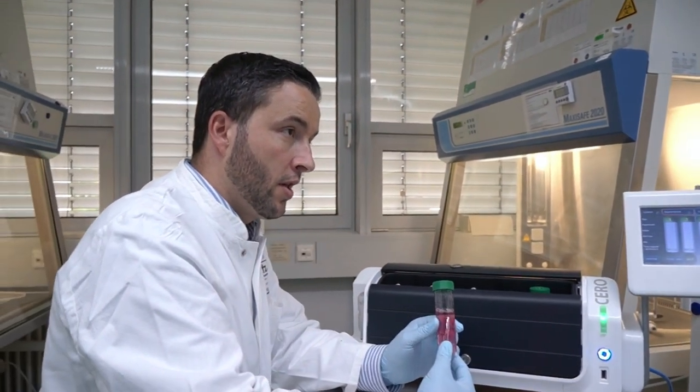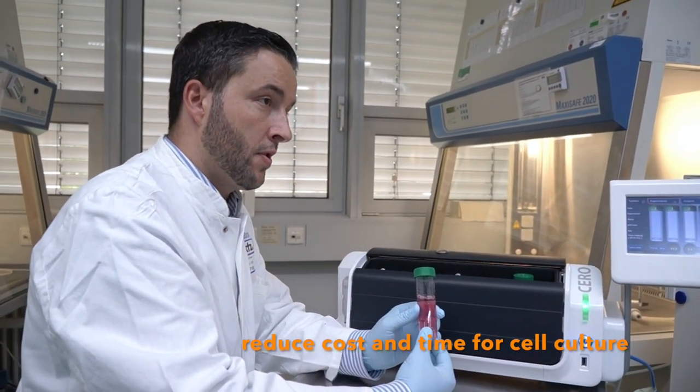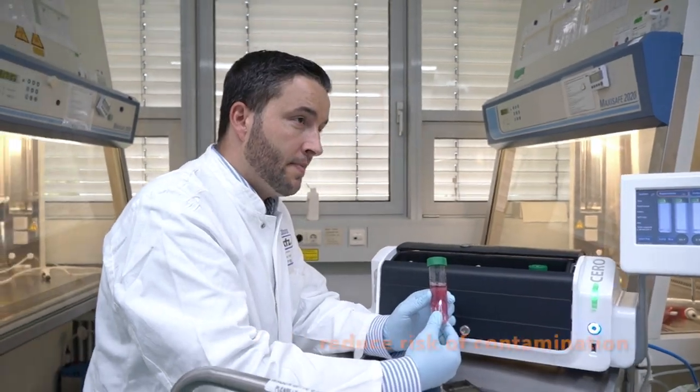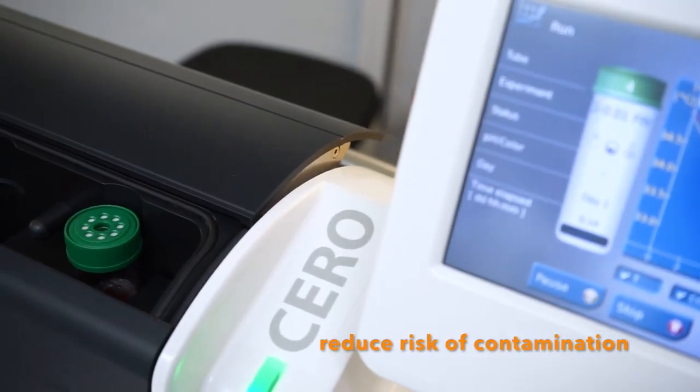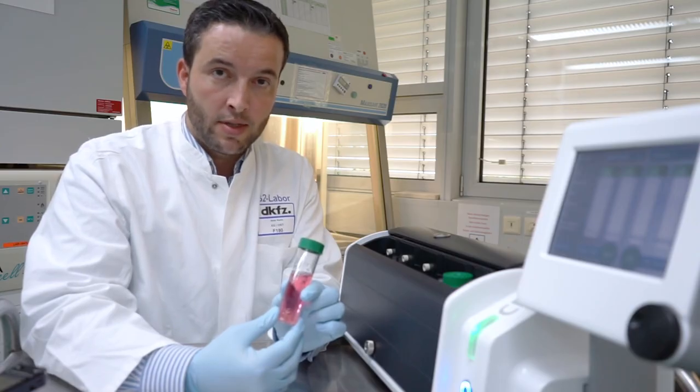With the CERO technology you will reduce the cost of your supplements, you will reduce the time, and you will reduce the risk of contamination in your cell culture room.